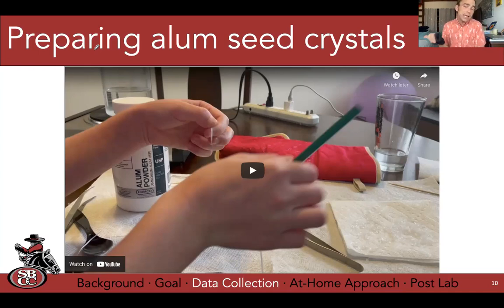And then the most important thing with any lab, and unfortunately it's your glassware, is that if something slips, because obviously whenever you're using towels and things like that, your grip becomes not as good. And if something drops like that, it's important to just keep your hands and body away and let it fall and break. Now that is much easier to say when it's our glassware and not the things at home, but just keep in mind that there's very little good that can come from chasing boiling, breaking glass.